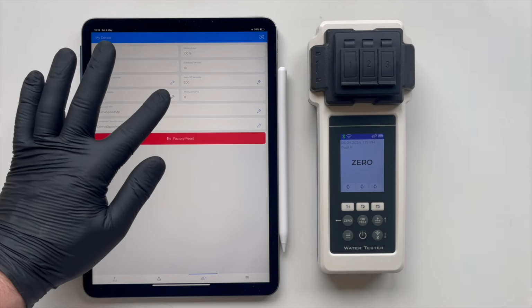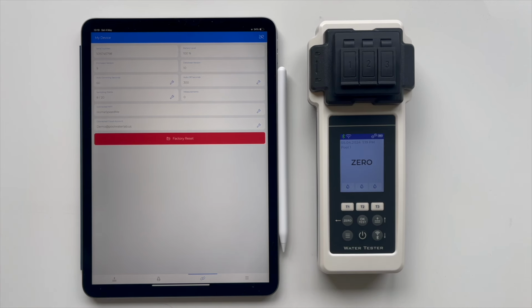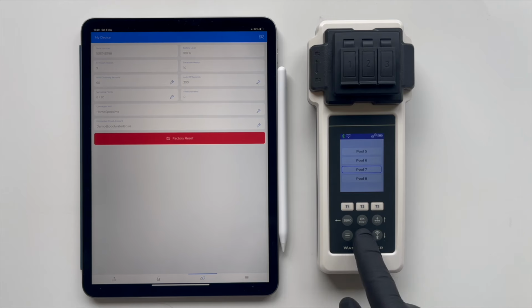Next, we need to update the sampling points. Press OK again to send the data to the device. Now, we will proceed to conduct testing for the sampling point Pool 7. For those who need a more comprehensive guide on performing the tests, all detailed instructions can be found in the user manual. This manual provides step-by-step guidance on how to properly use the tester, ensuring that you achieve accurate and reliable results. Select the necessary sampling point by navigating through the tester's menu. After conducting the tests, we will give you a detailed demonstration of how it works with cloud storage.